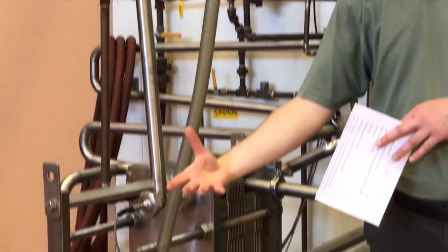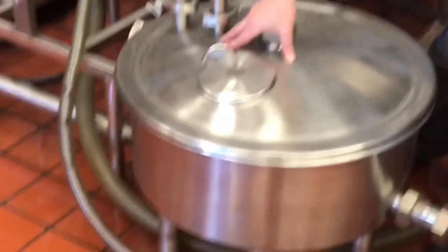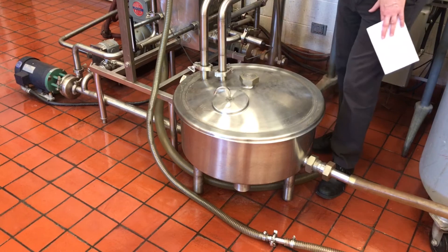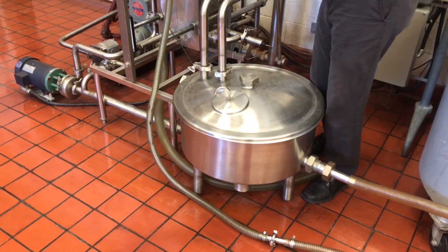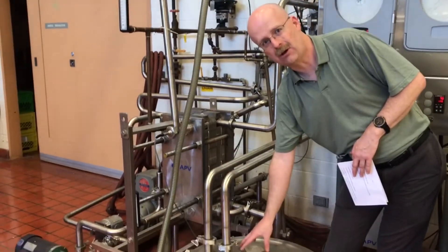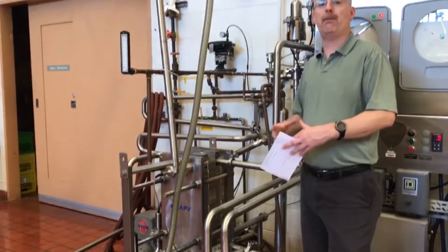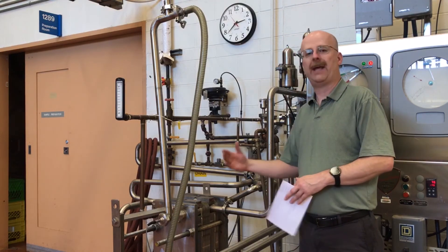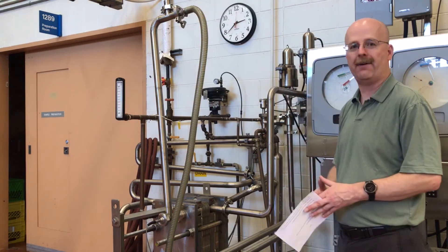Then it goes to the filling equipment. The constant level tank is physically located below where the action is occurring. If there was a problem — a power failure or equipment failure — we want our raw unpasteurized milk draining back into this constant level tank. The system is basically designed so that no raw milk, under any circumstances — whether a power failure or equipment failure — would ever get into the pasteurized milk. That's why it's important to keep our pressure differentials and make sure we have our temperatures.